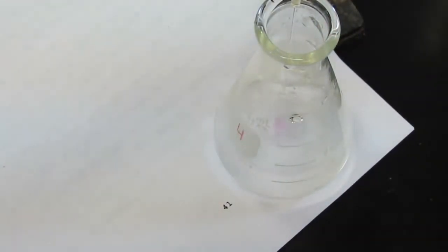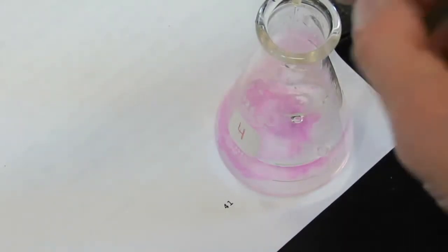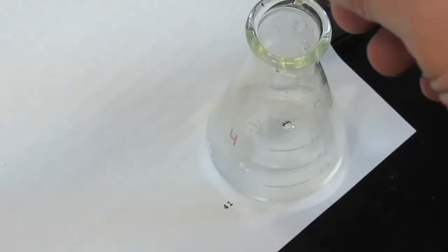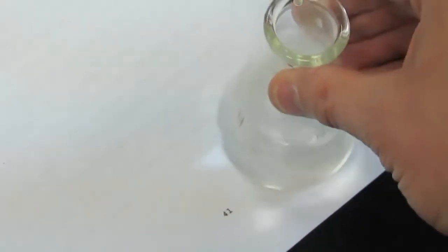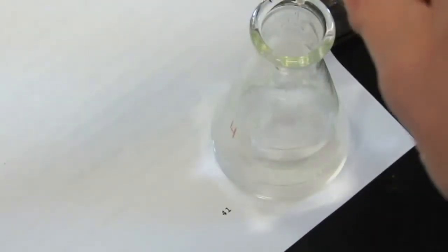And so as we add our base, you can see the pink color is there for a moment, where it's highly concentrated in base. But you'll see that as the base molecules come in contact with acid molecules, they're neutralized, and the pink color quickly dissipates. What we'd like to do is to have that pink color stay for 30 seconds, and we want to get it to the exact drop. So we'll continue to add, and let's see what happens here.